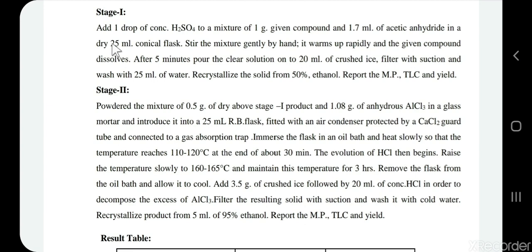After five minutes, we need to check the TLC. If the reaction is complete, we pour the solution into 20 ml of crushed ice — the organic compound will precipitate out. We filter it and wash it with water, since acetic acid and acetic anhydride are easily washed away. We then crystallize from 50% ethanol and report the melting point, TLC, and yield of this Stage 1 product.